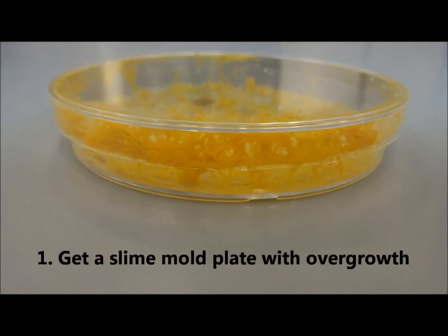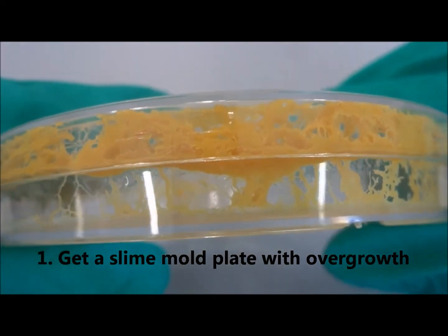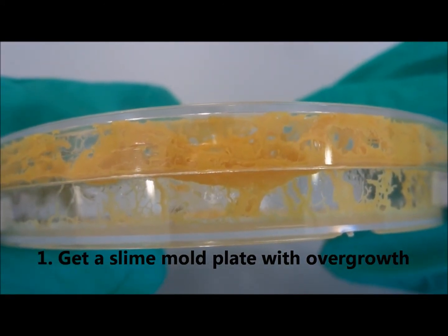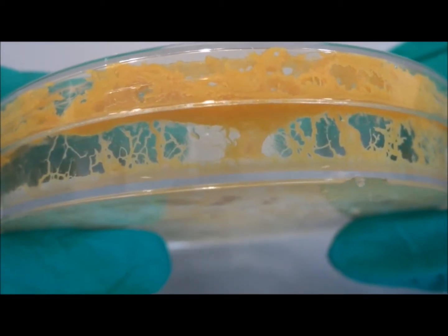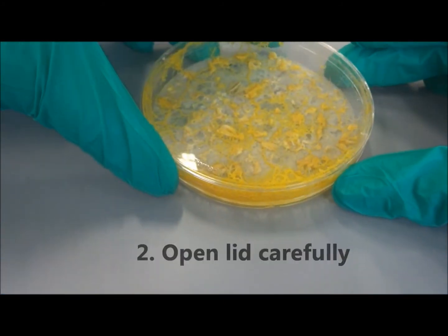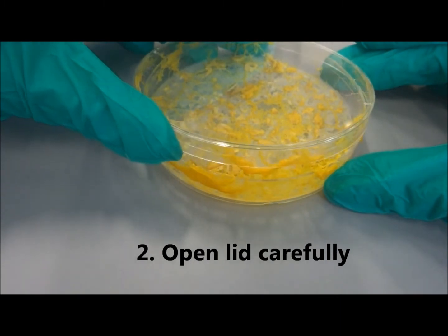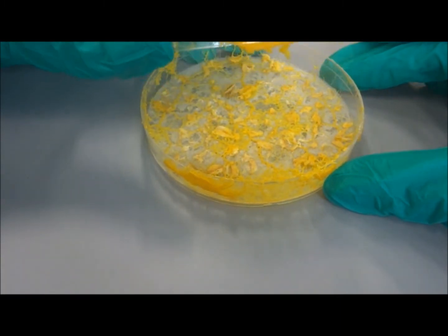First, get a plate of slime mold with excess growth. After about one week of storage, the slime mold may grow onto the lid or even out of the Petri dish. Carefully open the lid of the Petri dish. The lid can be slightly stuck to the Petri dish because of the excess slime mold.